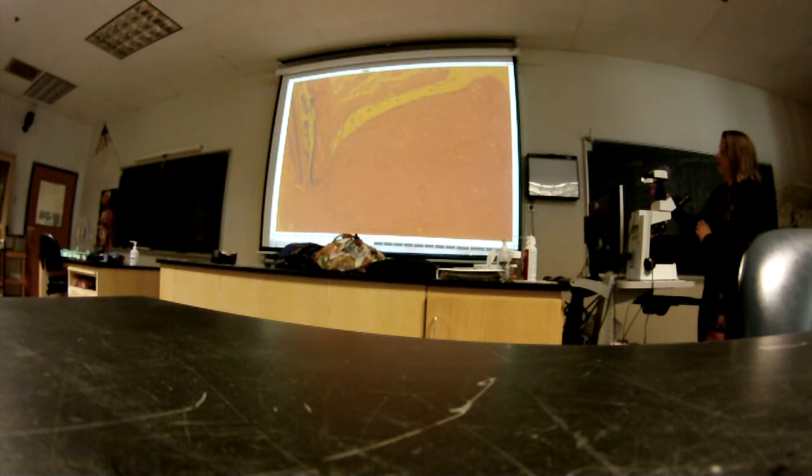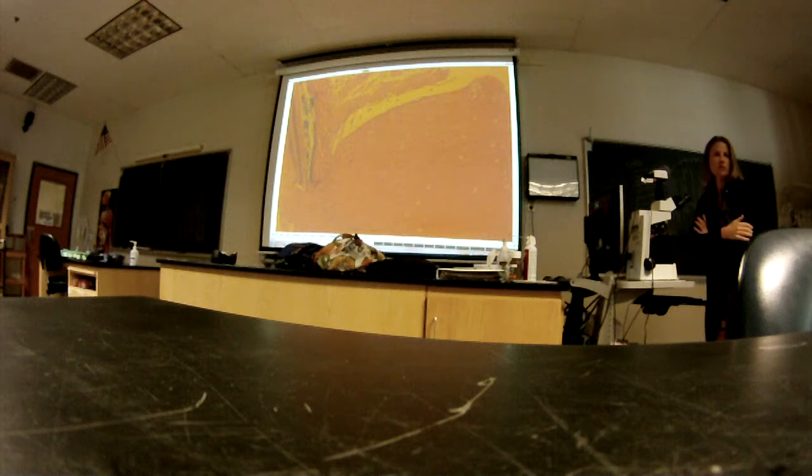The way it stretches from here to there, and then if we go this way, we see this optic nerve. This same structure, well, related structures, coming out the back. What's this structure? Optic nerve. That's the optic nerve, coming out of the eye. What's inside there?